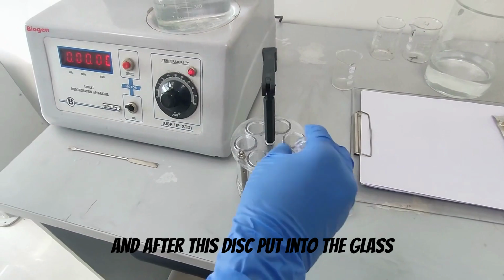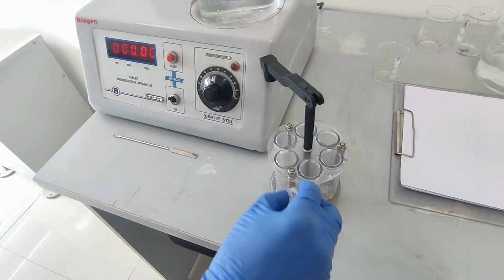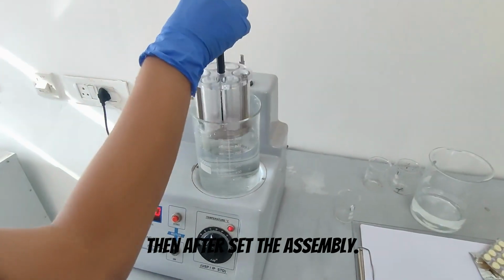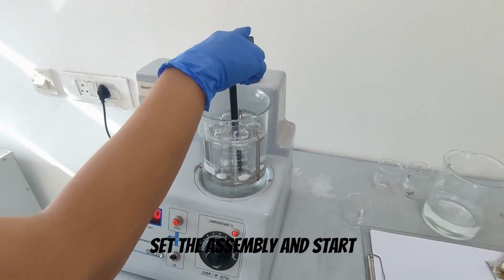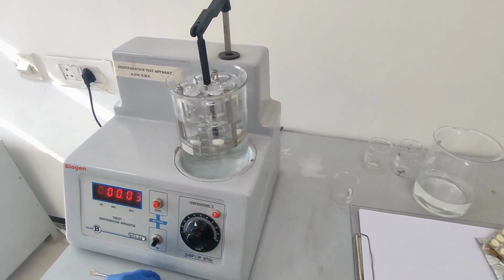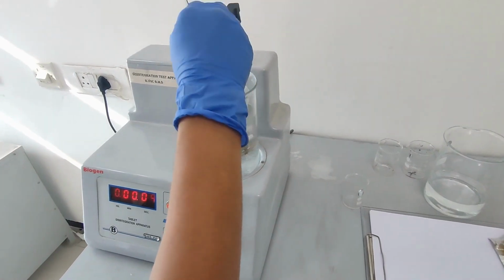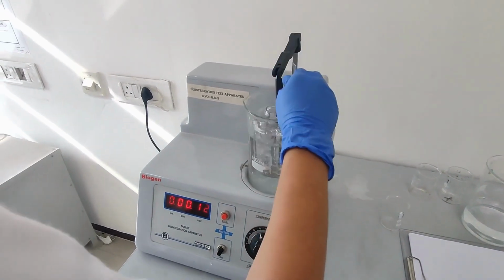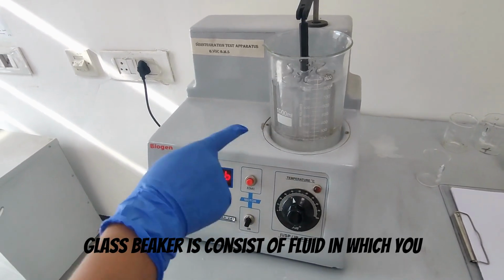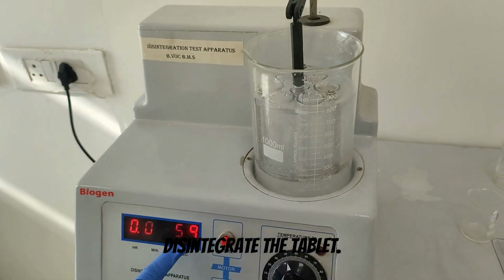And after this, the disc is put into the glass section. Then set the assembly. Set the assembly and start. They are immersed in the glass beaker. The glass beaker contains fluid, in which you can see how much time is required to totally disintegrate the tablet.